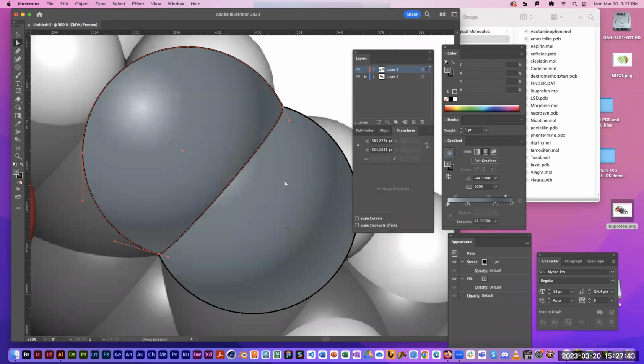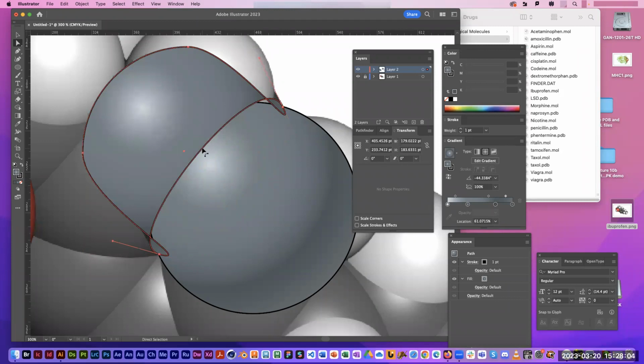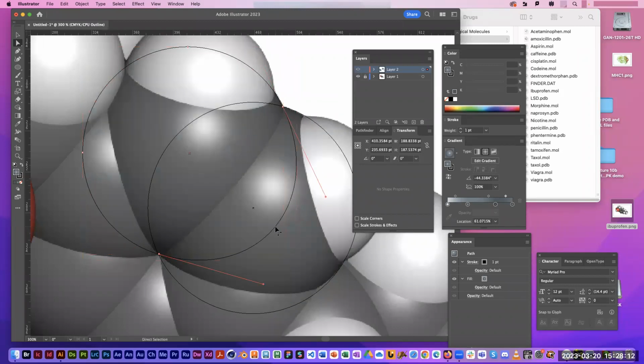Now watch what happens when I drag out this piece of path. It just drags it out and makes it a little curvier, but it's not making my handlebars rotate around in weird ways. I could drag this way out here if I wanted to, or drag it back this way. Okay, that was a bad example, but I could drag it way out here and it would look fine. So this allows me to simply drag this path and position it exactly where I want it, right along that edge on my PyMol image.